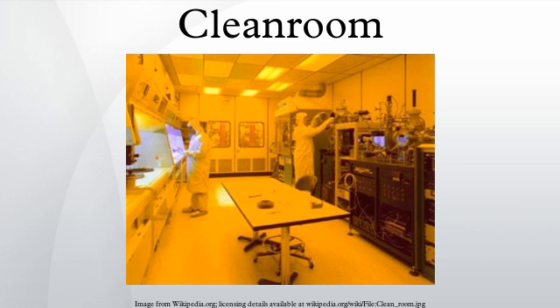In assessing cleanroom microorganisms, the typical flora are primarily those associated with human skin, although microorganisms from other sources such as the environment and water are also detected, although in lower numbers. Common bacterial genera include Micrococcus, Staphylococcus, Corynebacterium, and Bacillus, and fungal genera include Aspergillus and Penicillium.